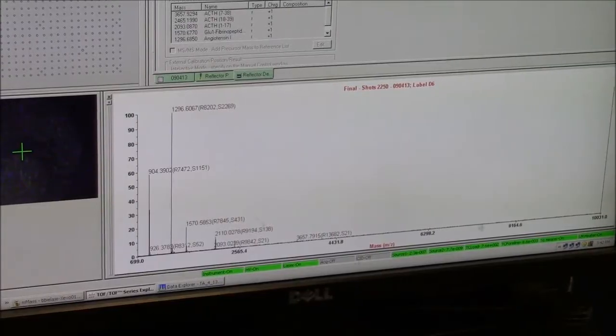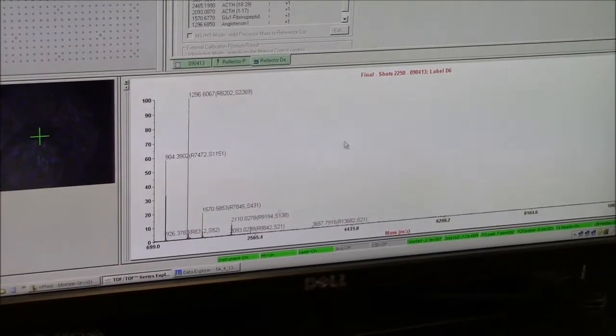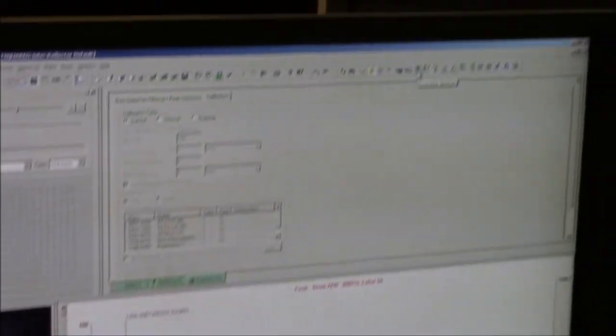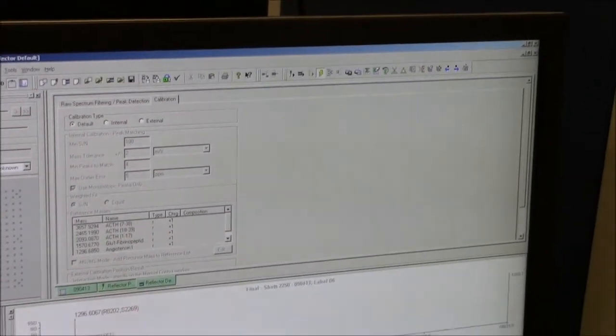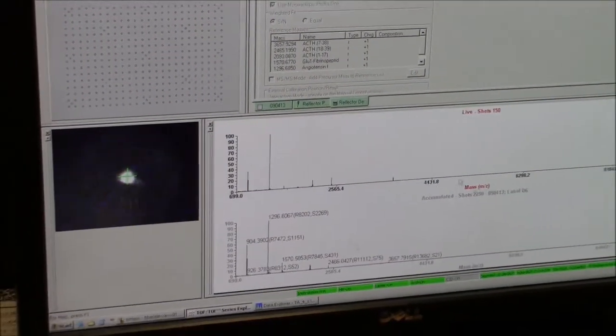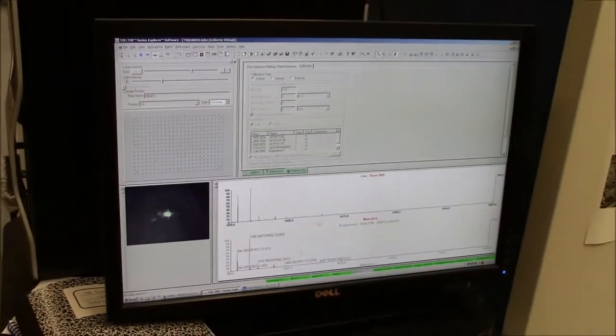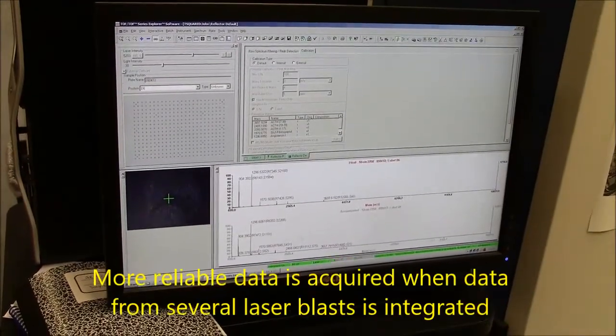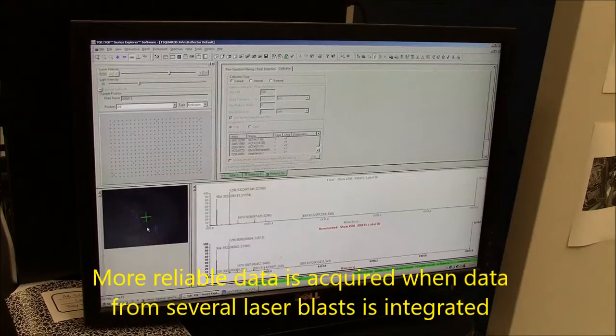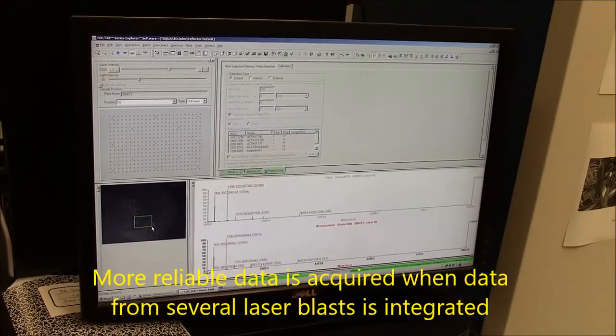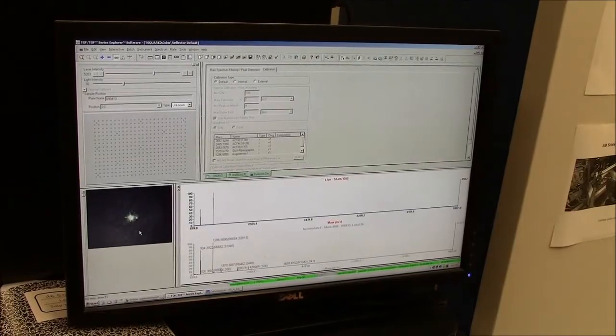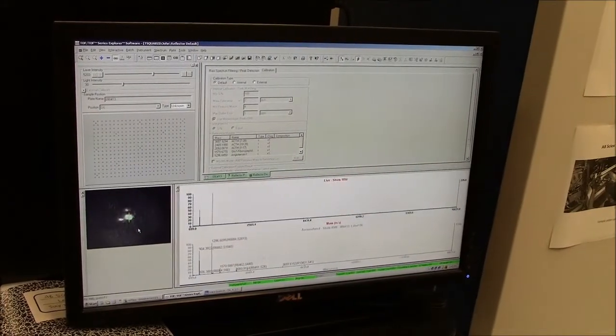Since it's hot spotty, I always recommend people sum data. So this is one accumulation. You want to hit the accumulate spectra, and that will add it into the sum. And then you can go ahead and shoot a couple more times around the plate. Because it's so differential, this ionization, it kind of gives you a better shot if you accumulate a couple of them. You can double click to move around the target. Left click, double click to move around. Super hot spotty, MALDI.